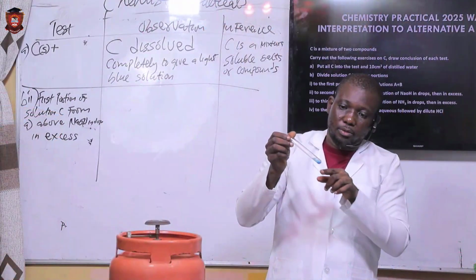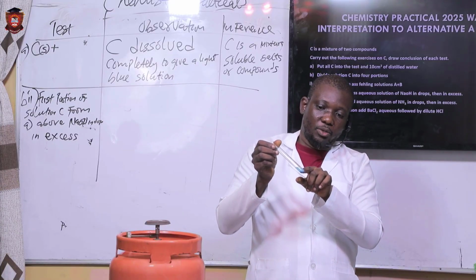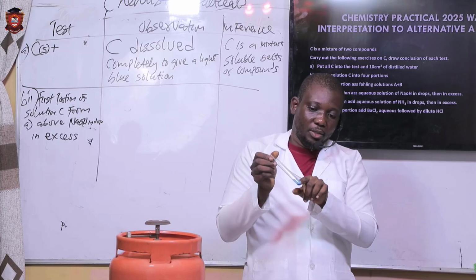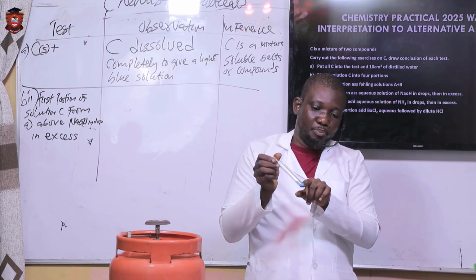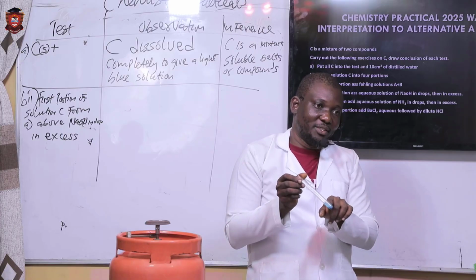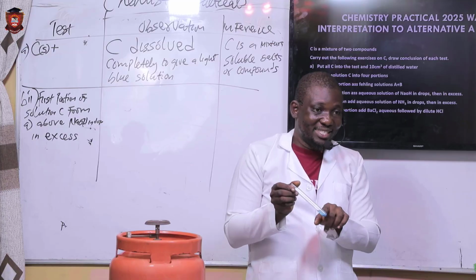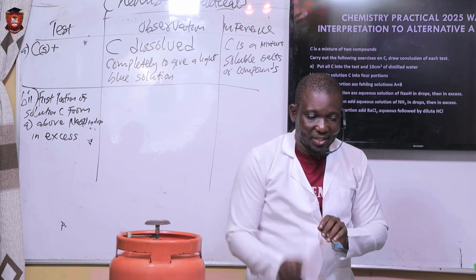Okay. So look at this. Don't go down. Look at this. What you are seeing is, what is the color? Pale. It's not a sky blue. We don't use sky blue. We call it what? Pale blue. And it's gel-like. So it's stated like that.